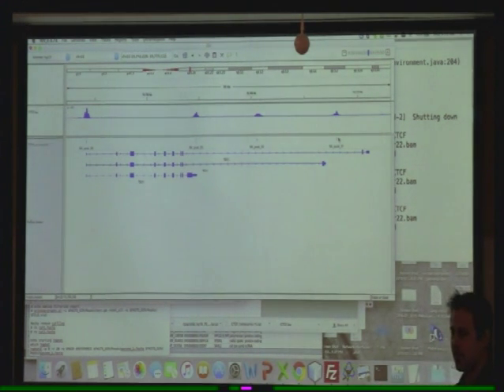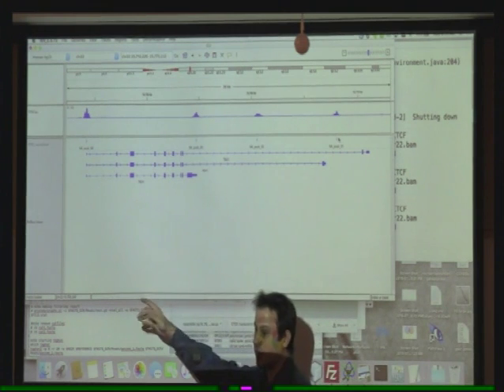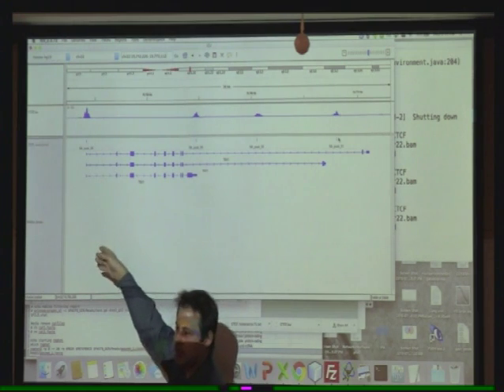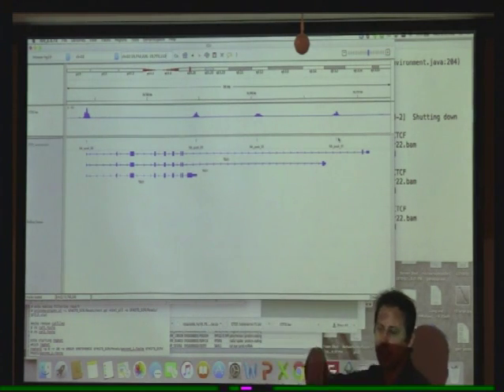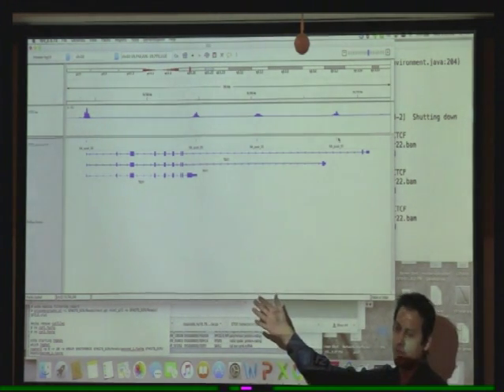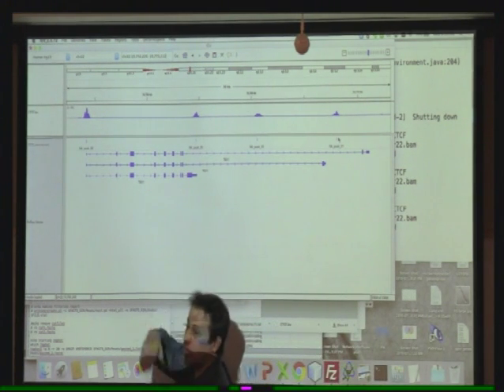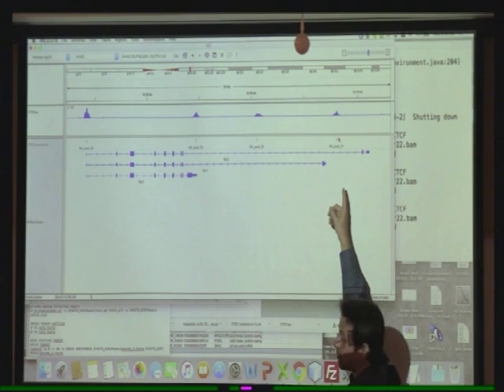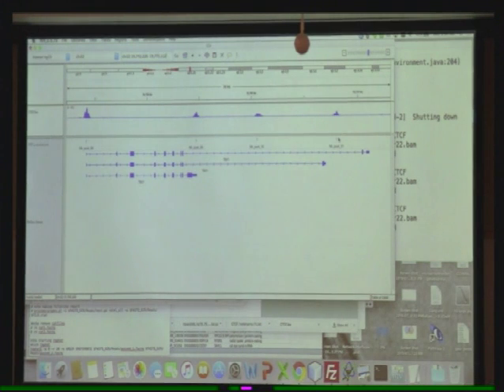Now you could say, hey, professor, I think that this transcription factor, CTCF, regulates TBX1 because there's a huge peak on the transcriptional start site, which is right here. And you could show them the data like that. You can't just say, here's chromosome, whatever, start and stop. It's nice to see visually, and the coverage is how high this peak is. So you can see that you have a lot of peaks within this gene. So this is a great way to visualize your data to present it to people. Okay?